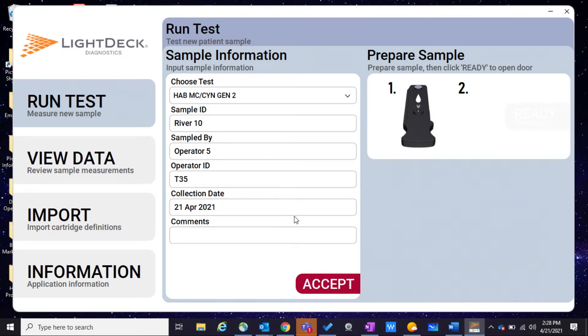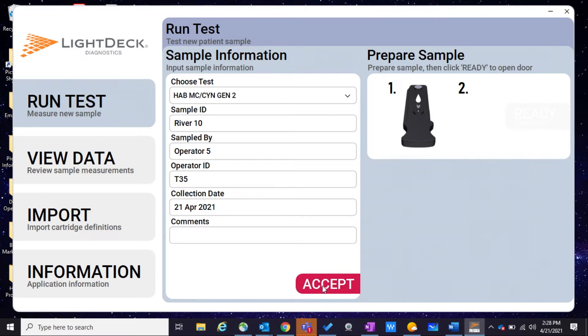And then once all that information is in there, we'll click Accept. And now we're ready to run the sample.